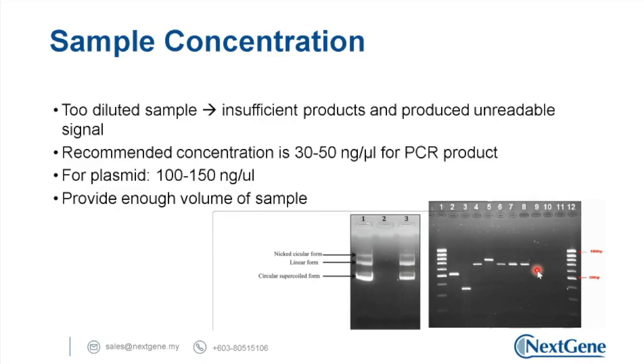So when it reached the sequencing house, the DNA may be degraded, and when we load it on the gel, we do not observe anything. Although we are quite convinced that the sample was good, when it reached the sequencing house the band was no longer there. Of course, when we load a very low concentration template, the cycle sequencing event will fail.